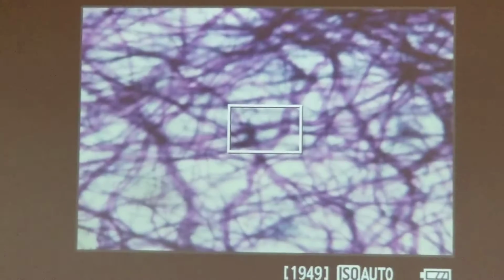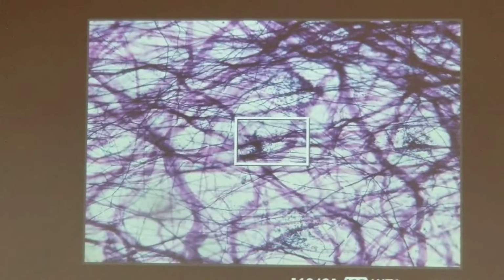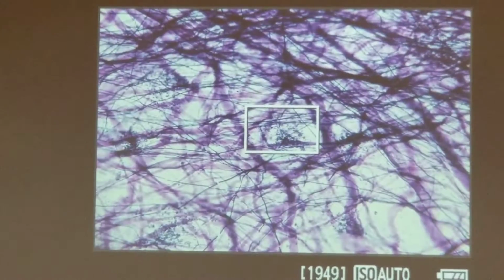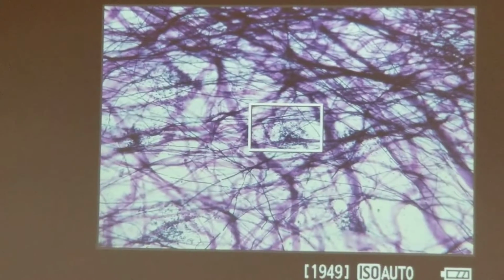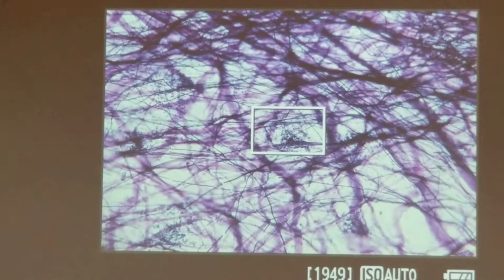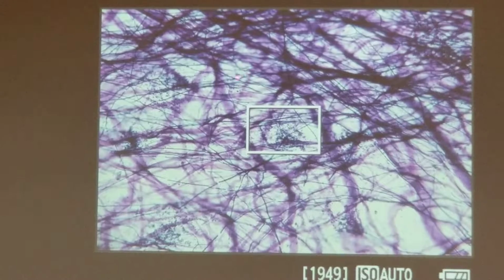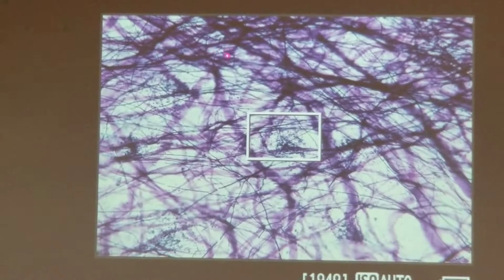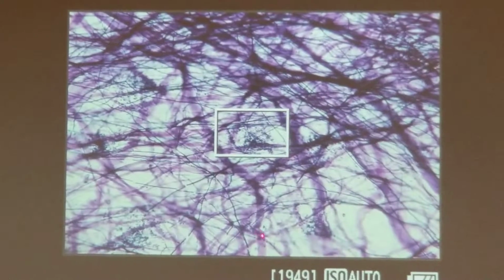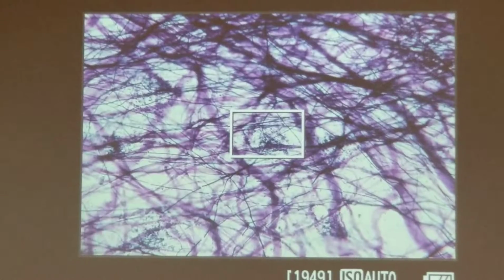Alright, so we go to here, we'll go to 40. Right? So remember, the fibers are really widely spaced, okay? This is a really poor slide for the mast cells. They look a lot better on your slide than they do on this, okay? So in your outline you see fibroblasts/fibrocytes. All the little dark dots you see are gonna be fibroblasts and fibrocytes, kind of scattered. You'll see them better on your slide than on this one. I probably got the worst slide on the butt. So you don't have to distinguish or differentiate between the two.